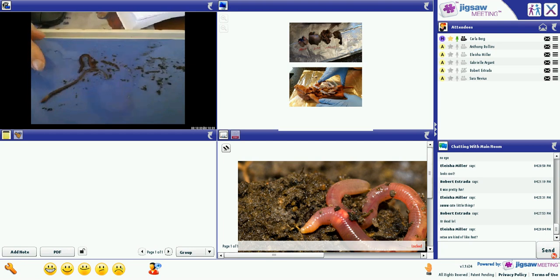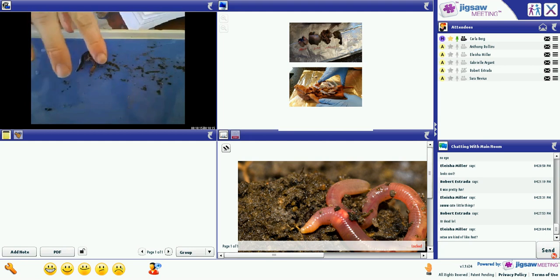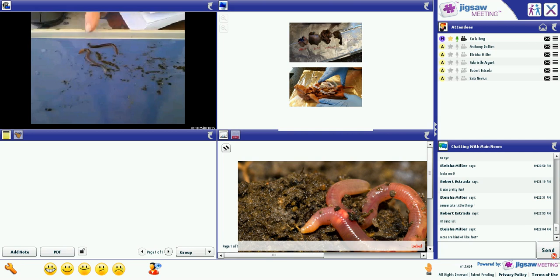So the first thing I want you to do is touch the anterior end of your worm. The anterior end is its head. So let me separate my worms here. I'm going to dip my finger in the water, and I'm going to touch the anterior end, and I'm going to see what my worms do. They sort of tend to shrink away from what is touching them.